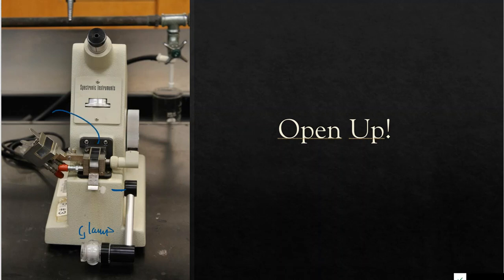And then I'm going to open up this area here, which is what we call the prism. And the prism is where I'm going to put my sample eventually, okay? So this provides me the surface. I'm going to put a few drops of my sample on that surface. I'm going to close the prism back up, and then I'm going to raise the lamp back up when I get ready to read. So a couple of things are going to have to happen here, okay?